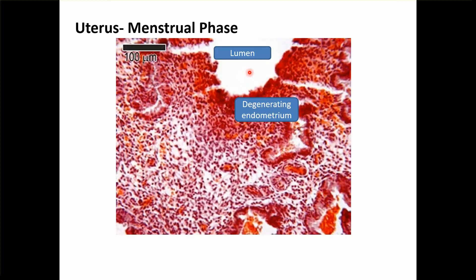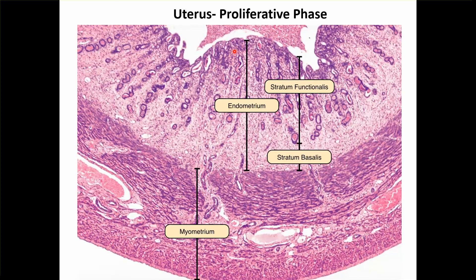This is the menstrual phase showing the degenerating endometrium. The uterus lumen is lined with simple columnar epithelium. The entire endometrium can be divided into the stratum functionalis — the upper two-thirds — and the lower one-third is the stratum basalis. Then there is the myometrial layer, also called stratum vasculare, which has many blood vessels, and the outermost is the perimetrium covered by simple squamous epithelium.